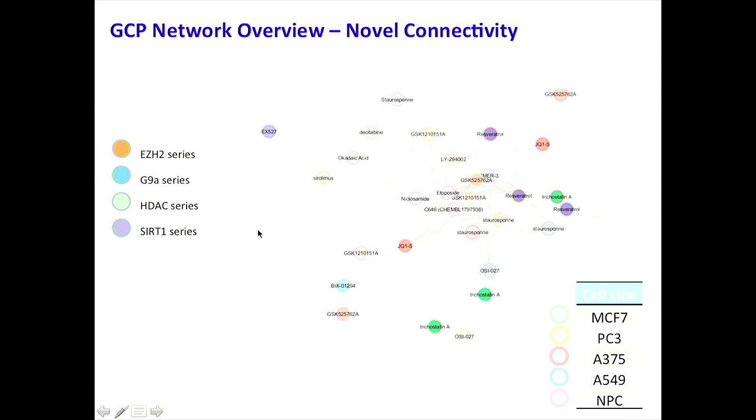And then we can observe new clusters of biology, things where we didn't quite know what was going on from some of the drugs that are not necessarily chromatin-active compounds. Actually, I misspoke. This is 64 different compounds. This includes some of our neuroactive compounds here, so it's even more. It's probably around 1,000 samples or so here. And what we can see is this kind of new cluster that contains the drug resveratrol.